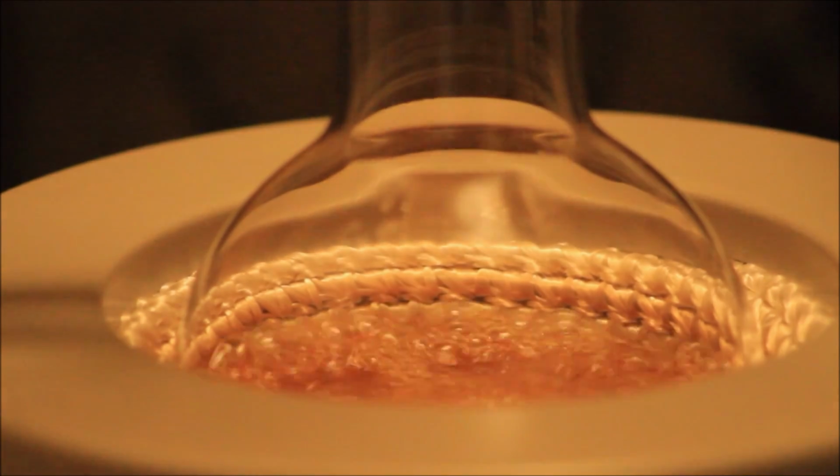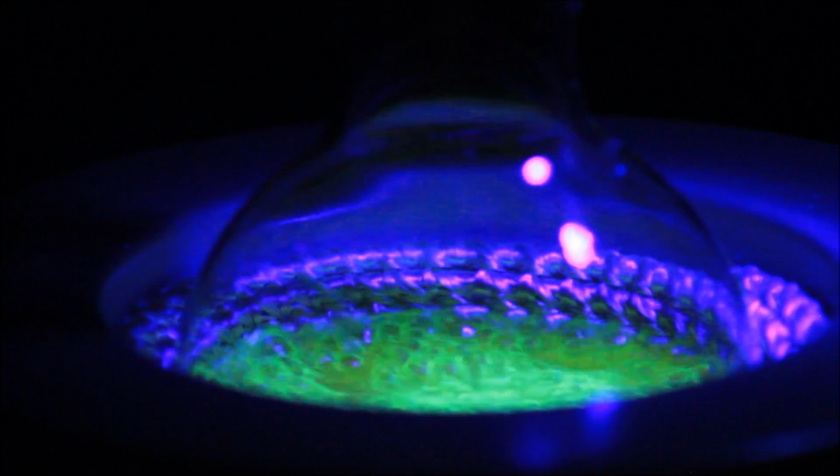Curcumin has another interesting property. Alcoholic solutions of curcumin show a nice green fluorescence.